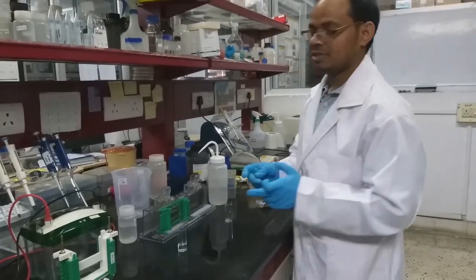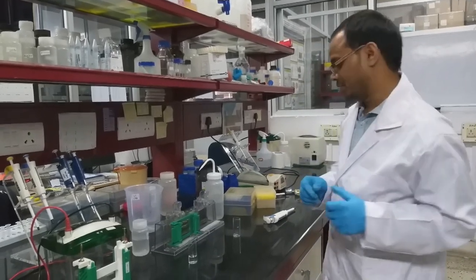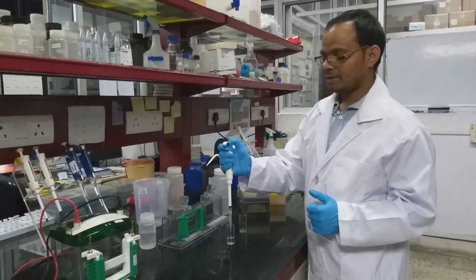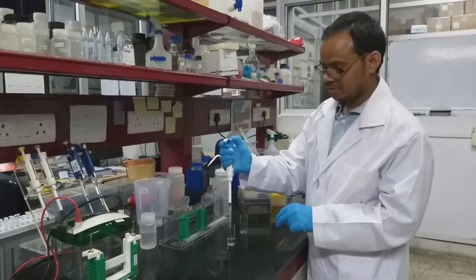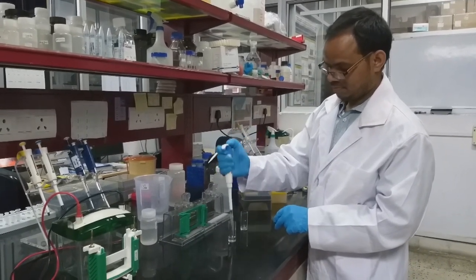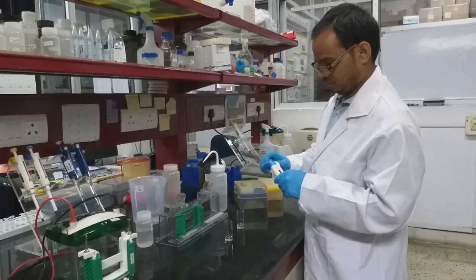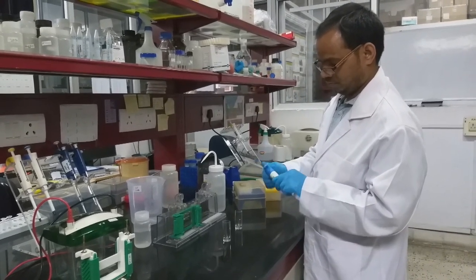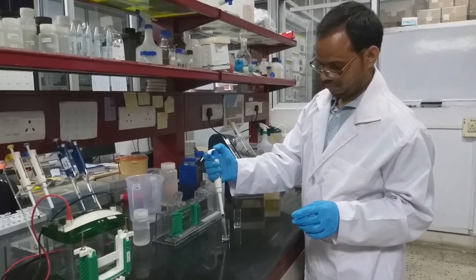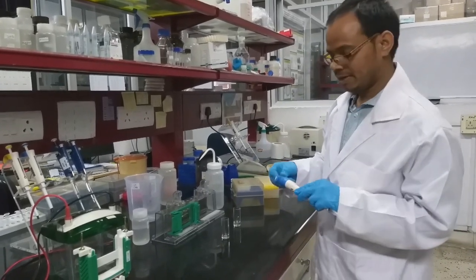So now we will start preparing the stacking gel. The compositions are given in the video. You have to add 3.4 ml of water first. Next, 830 microliter of acrylamide.